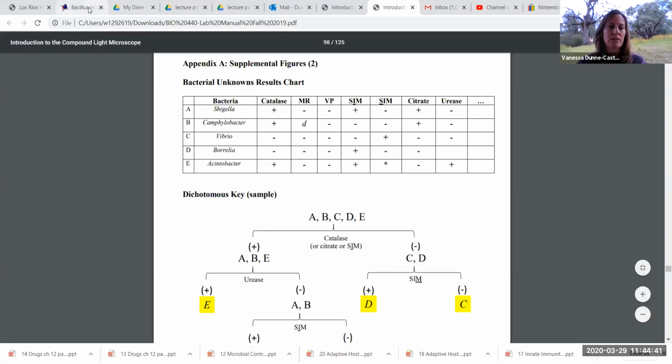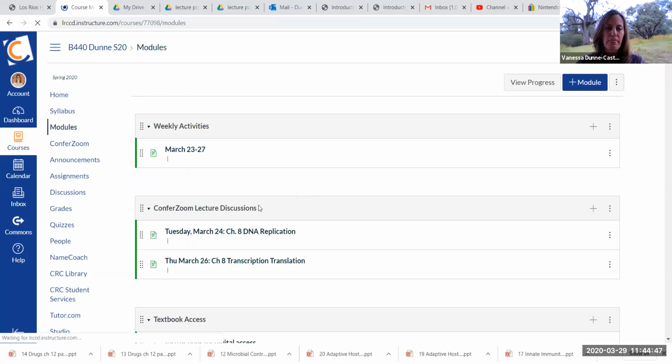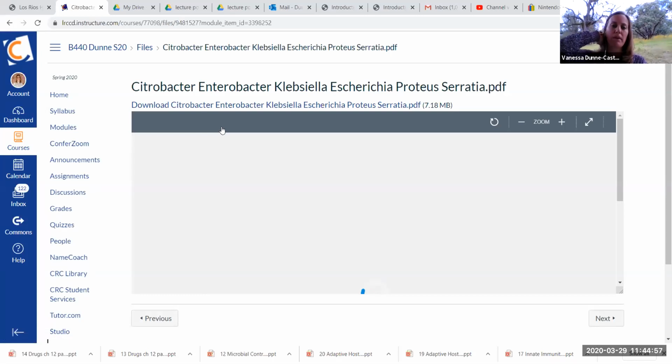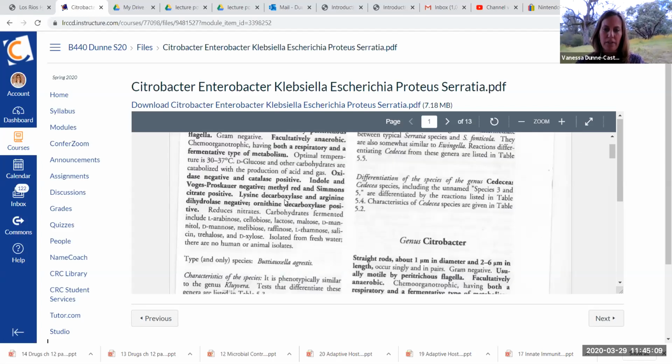And to do so, again, you go back to Bergey's pages. Let me give you a better picture, not Bacillus, because this one's a little bit tricky. Let's say you have gram negative, then you'll click on, there's a couple of different ones that will apply to you. I put most of the gram negatives in the same category here. And so your job is to go through all of these pages and pull out any information that's relevant to what we have available for testing.